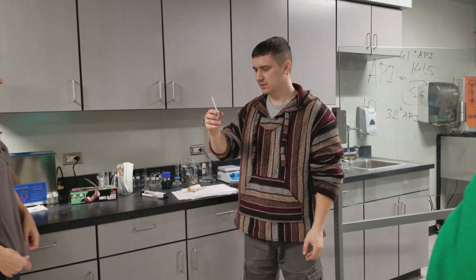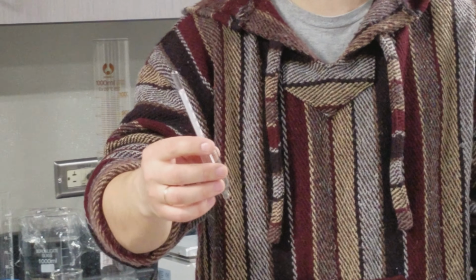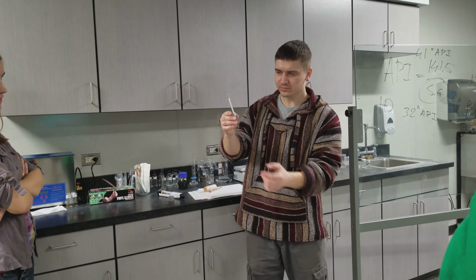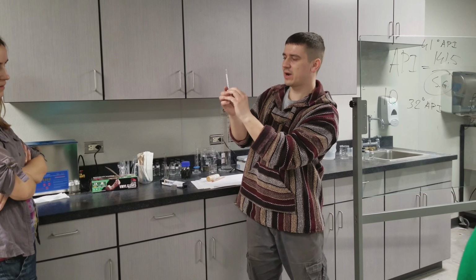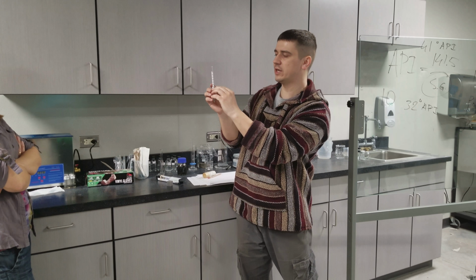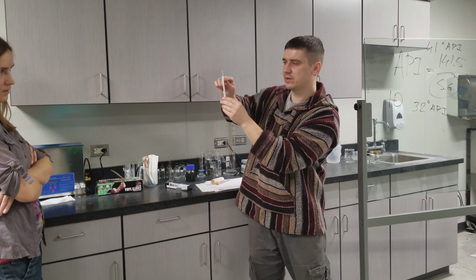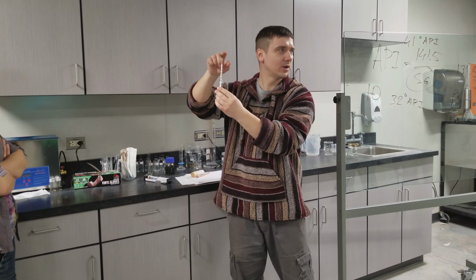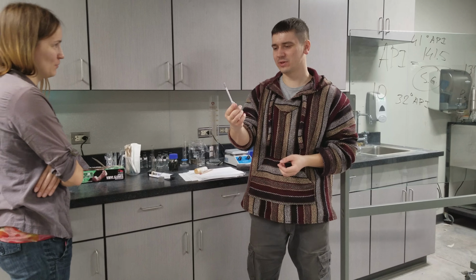This device here is a floating device. What happens is you pour oil in a beaker or in a cylinder and just dip it into there and let it float. And it's graduated. Specific gravities are fractions of 1, going from 0.800 to 0.900. So the surface of the liquid will be somewhere in between, and you just read that value right off the graduated floating thing.